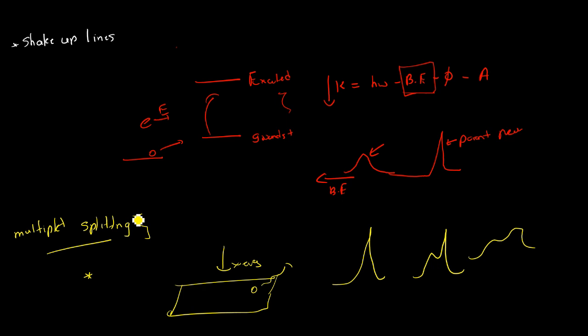So I will not go into much more detail regarding the multiplet splitting, because it's a really interesting factor, right? There's a lot of analysis which we can do with the multiplet splitting. We can identify specific elements, so I will dedicate another specific video for this, because currently, as you can see, the video is relatively lengthy and we also need to discuss some small examples. So I will keep this multiplet splitting topic for another day. For now, let's finish this session with a small example, shall we?